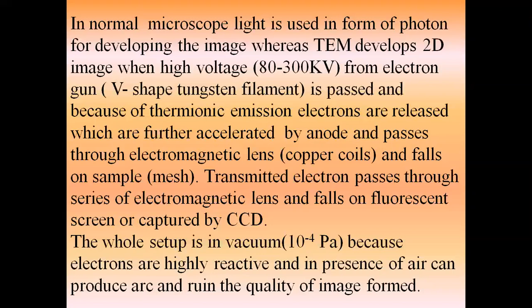According to the convenience of the sample you are analyzing, you can choose the size and the shape of the mesh. I will show you the picture of the copper coils and the mesh later on. Let me just continue with this.